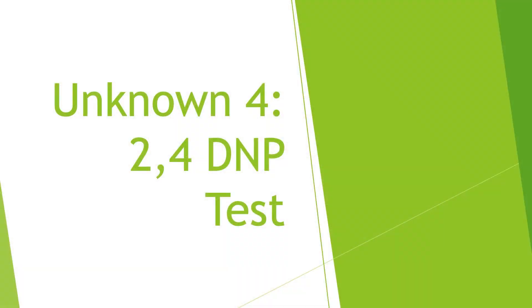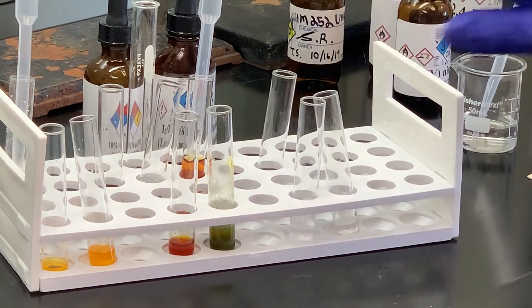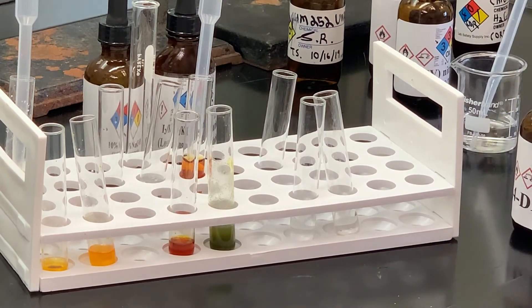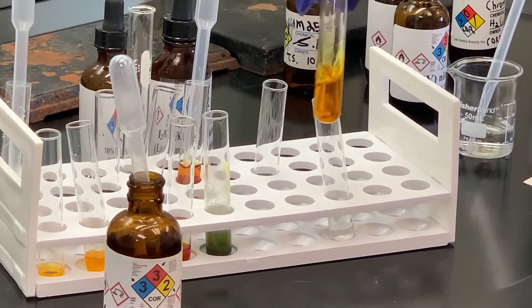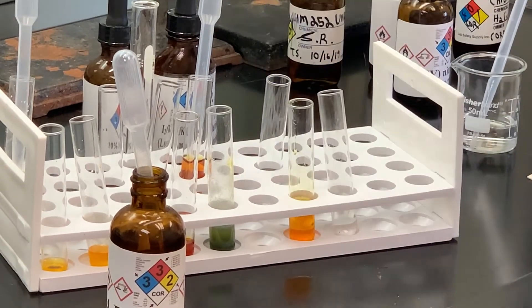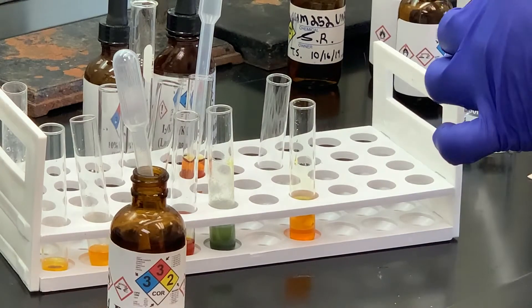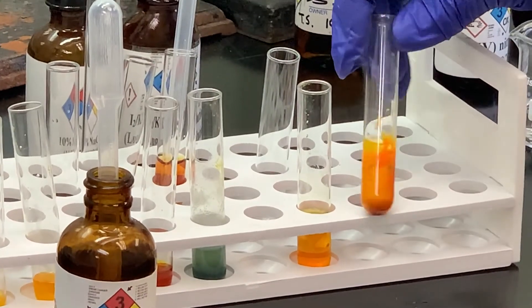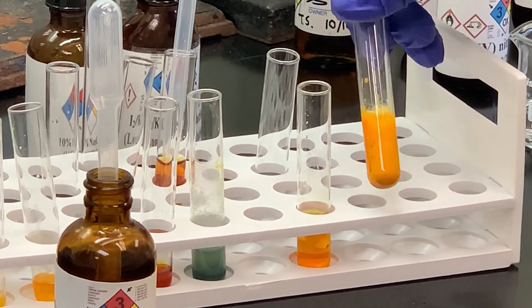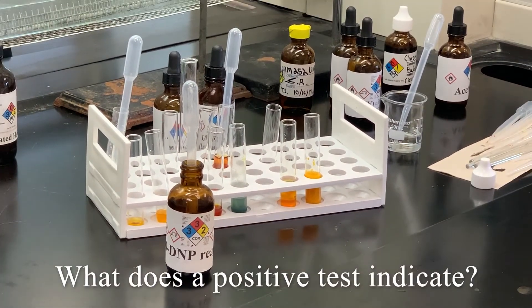The next chemical test we're going to do is the 2,4-dinitrophenylhydrazine test, the 2,4-DNP. The solvent used for that is ethanol. Both test tubes contain ethanol — I have a blank to compare. Here is our 2,4-DNP solution, and I'm going to add some of my unknown to that. Notice we immediately formed a precipitate with kind of a yellowish color. So we've got a yellow precipitate for the 2,4-DNP. Remember the 2,4-DNP test is positive for aldehydes or ketones.